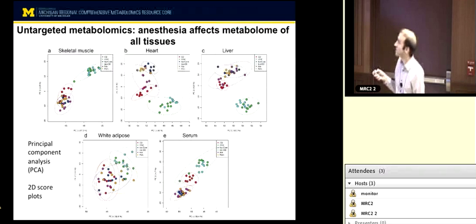And so you can see in the skeletal muscle, we have 2 major groups of samples. We have this CO2 and isoflurane overdose methods. These are both euthanasia methods. Then we have this cervical dislocation, which was a more rapid means of euthanasia that's in the middle. And then down here we have our 3 modes of anesthesia, all 3 of them overlapping fairly substantially.